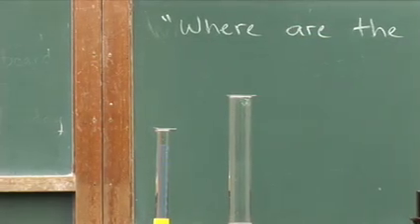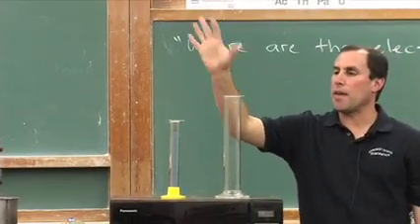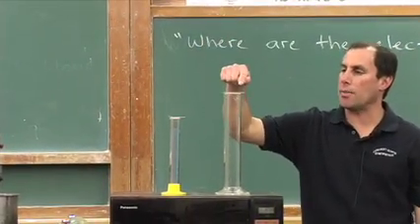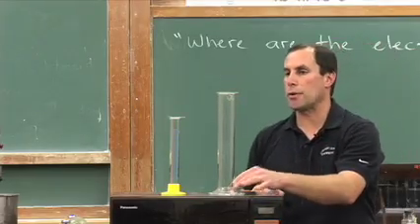So we have a little bit of solution on top of the phosphorus, and that's evaporating away. When the oxygen in the atmosphere gets to the phosphorus, we'll have a nice reaction on each of these graduated cylinders.